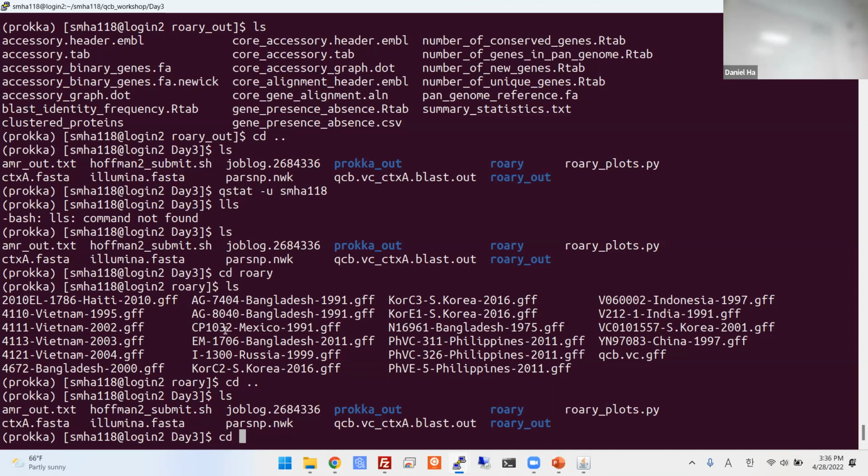I did get an error. Oh, okay. Oh, yeah, because the input path was different.